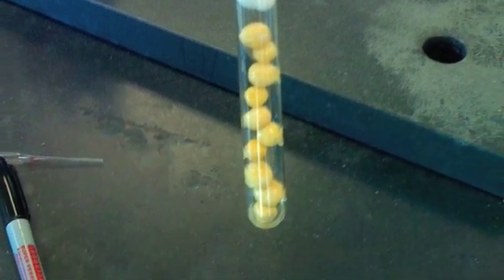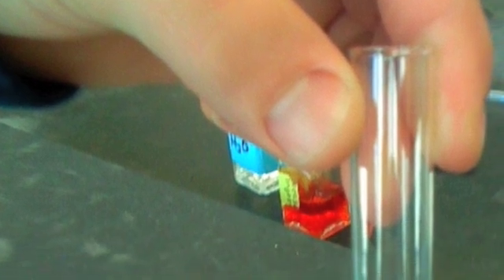Both of the test tubes had cotton balls placed above the peas. And I remember in the first part, we put KOH on top of the cotton because it absorbed all the CO2, which allowed us to observe the oxygen consumption that took place during the process of respiration.